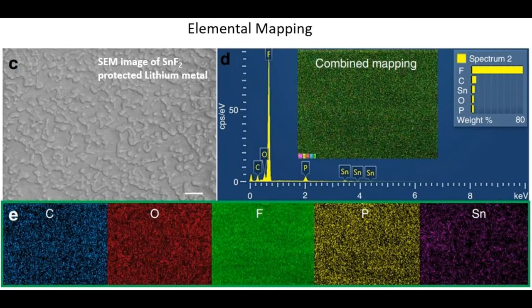Similarly here you can see the distribution of elements such as carbon, oxygen, fluorine, phosphorus, and tin in a tin fluoride modified lithium metal foil for battery application.